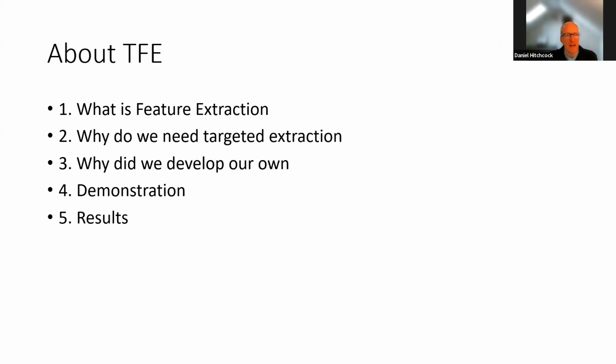Today, I'm just going to go over real quick what feature extraction is. I think most people know what it is. Then I'll cover why we need to do targeted extraction, why we developed our own tool to do this, give a brief demonstration of it, and then go over some of the results that we have.